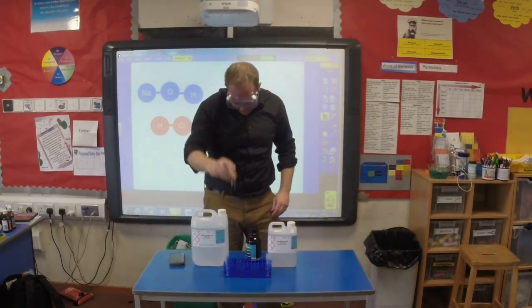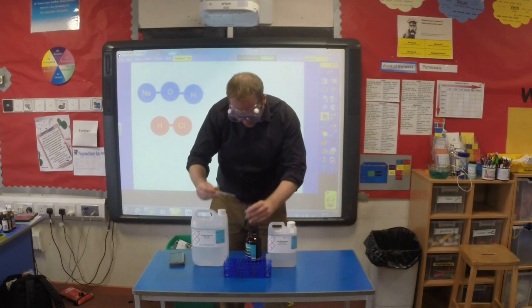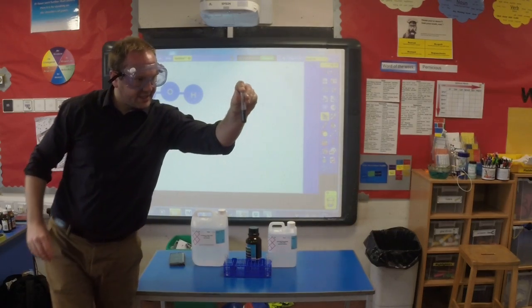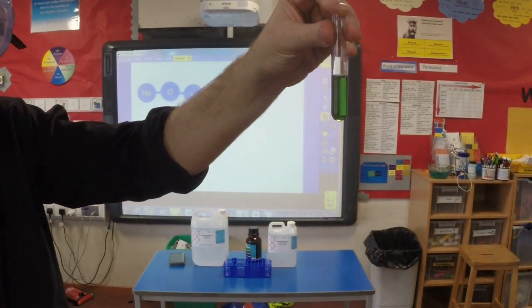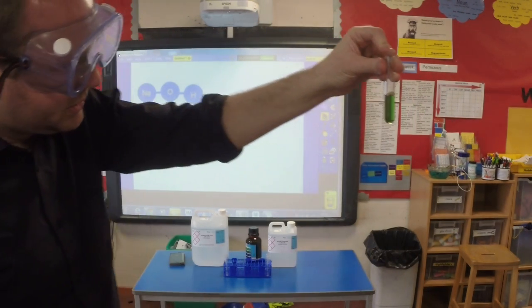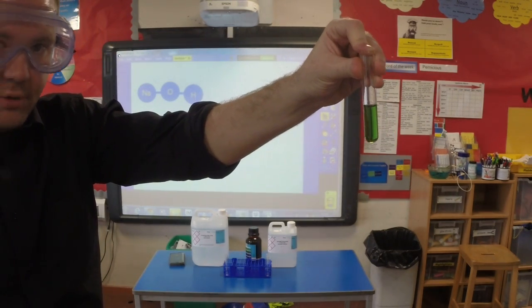With a little bit of experimentation, we should be able to get it so that the two actually cancel out. So I'll try this here. I've added just a tiny wee bit more acid. Now, I'm at the disadvantage of being colourblind, so that might be slightly on the red side, I don't know. I'm hoping it's green. Looks green to me. So that should now be neutral, hopefully.